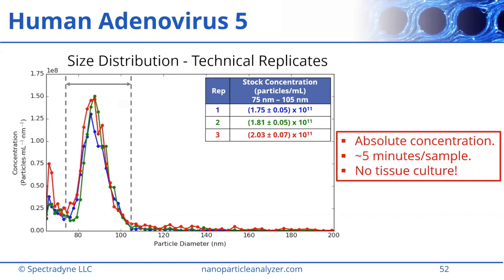first purify your sample. You need to plate out your cells. You need to serially dilute your sample. You need to incubate the virus with the cells, and this can take days, right? And then you need to count plaques, and hopefully you get one that's in the right countable number of plaques to give you the accuracy you need, and you need replicates, right? This can literally take days, and especially in human cells. And here we've got the same data in just a few minutes per sample.